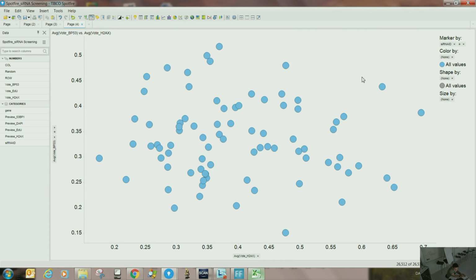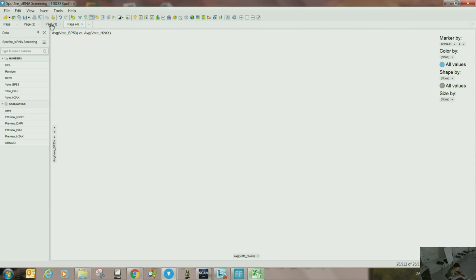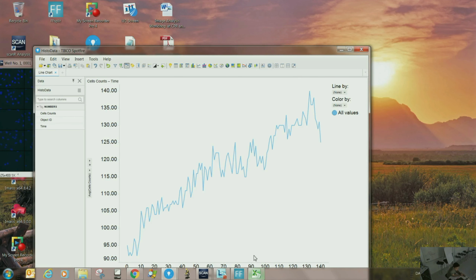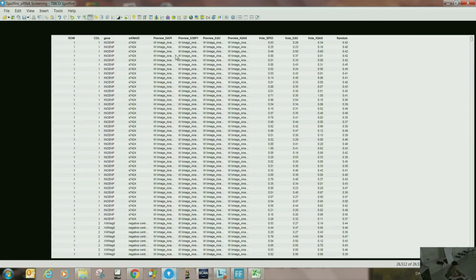But where do you see there are 700? No, actually I cropped it. Sorry, I cropped it. Because if I go for this one, of course it will take some time, right? I remember I cropped it because you can see it from this random number. I did this random number and cropped it, because that was just for demonstration. Okay, where was it? Yes, here.